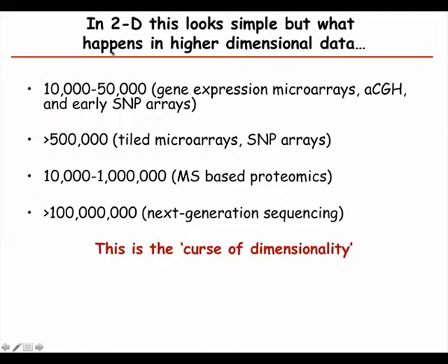So the raw data here, so this would represent the raw data in these different assays, is very big. So we try to then use our knowledge of biology to distill it down to a smaller number of dimensions. The other problem is that we have many measurements, but we usually have very few samples. I mean, in a proteomic study, 100 samples is quite large. So you can imagine we have all these measurements, but we only have 100 samples.